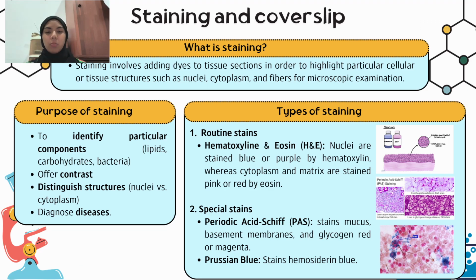Hello and Assalamualaikum. My name is Aina and I will be presenting about staining and cover slip. So first of all, what is staining? Staining is a process of adding dye to tissue sections in order to highlight the cellular structure of the tissue.